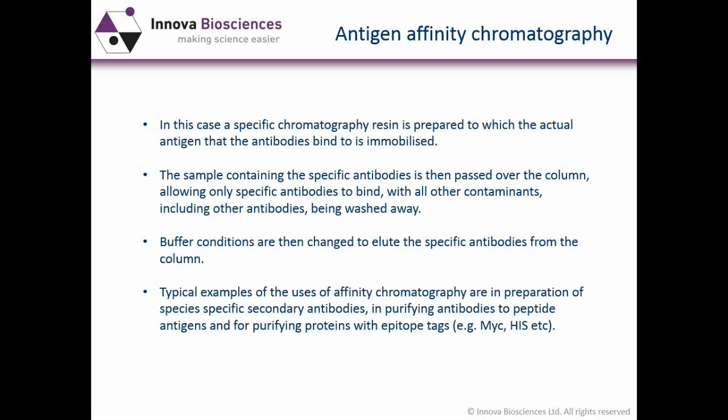Affinity chromatography is also widely used to purify polyclonal antibodies that have been raised against peptide antigens. And a form of affinity chromatography using columns that are specific for epitope tags is often used in purifying recombinant or phage display antibodies.